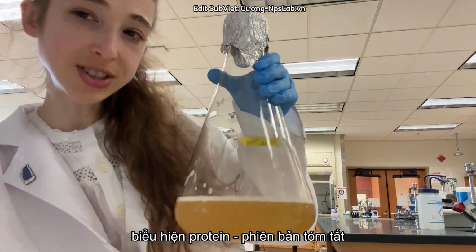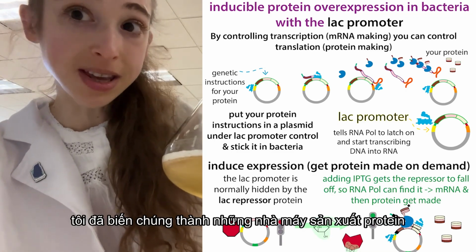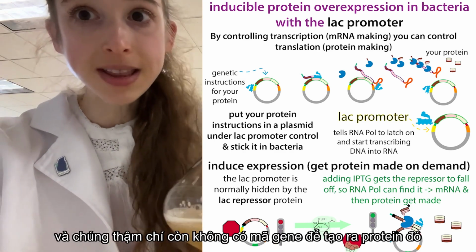Bacterial protein overexpression? Just the gist version. Basically, inside of this flask are lots and lots of bacteria that I've turned into factories for making a protein I want to study. Now, normally the bacteria wouldn't want to make this protein, and they don't even have the instructions for making the protein.